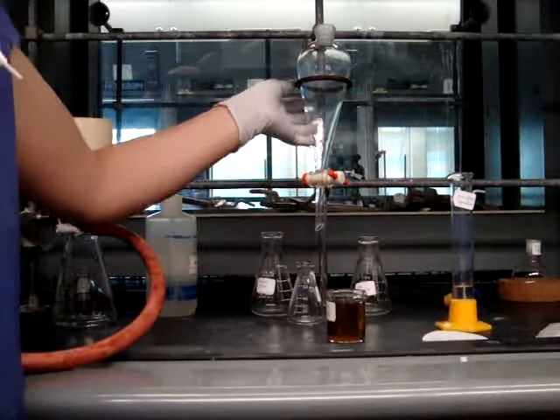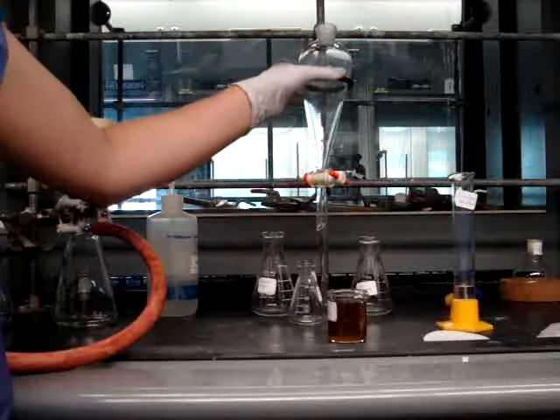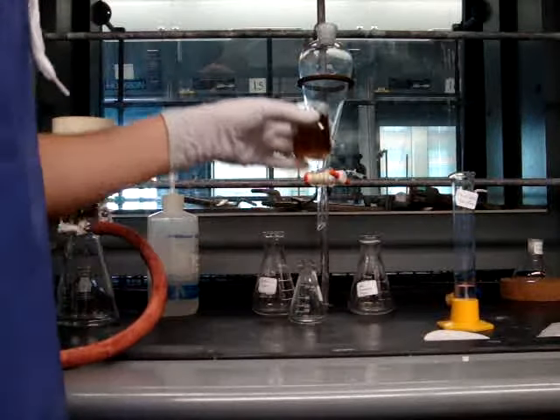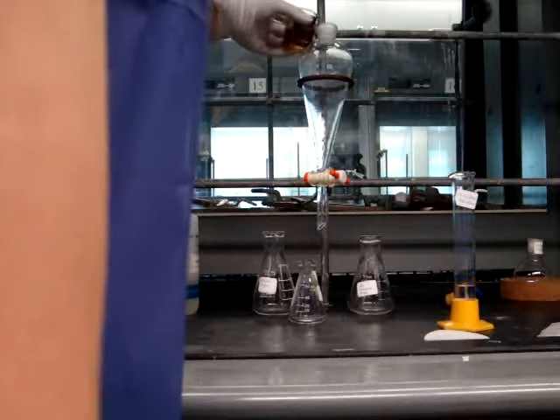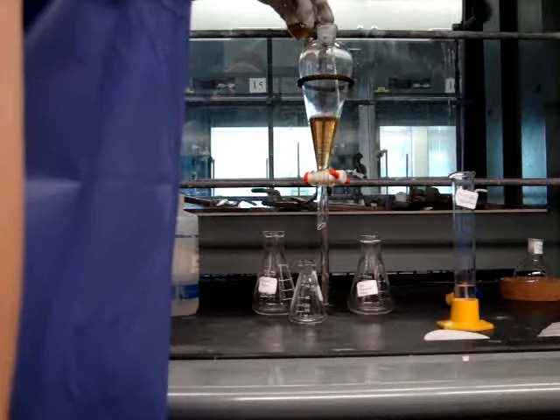This is a separatory funnel, which you must use a ring clamp at all times when it is standing in your hood. You're going to pour your compound dissolved in the organic solvent into the separatory funnel, making sure that it is closed before you do so.